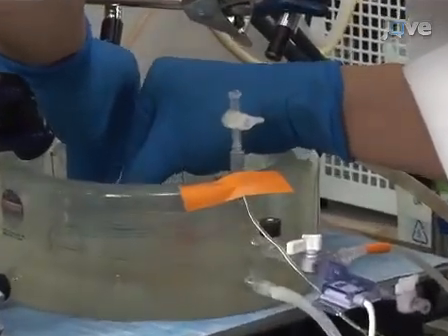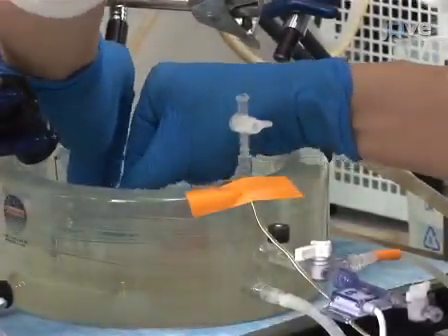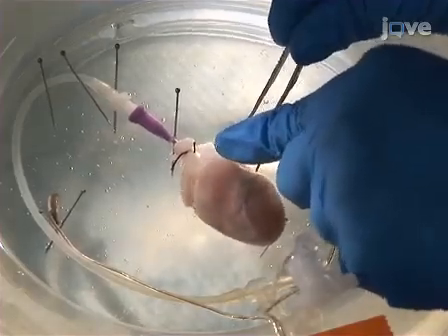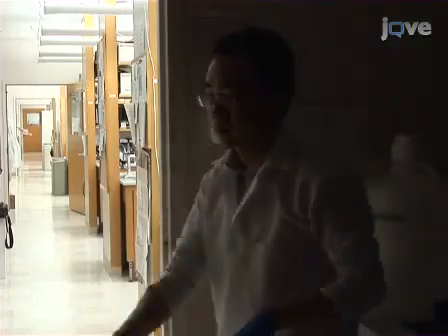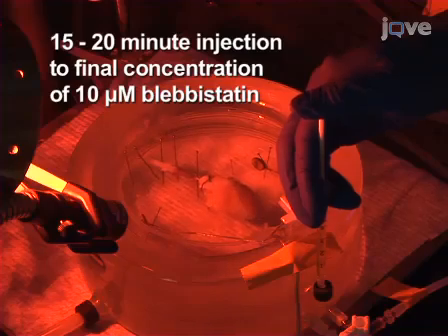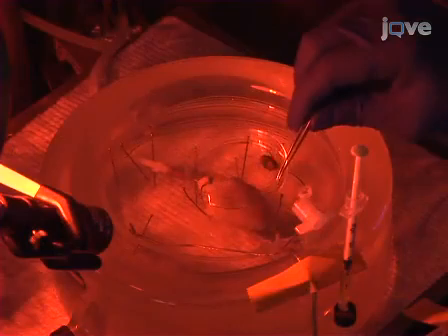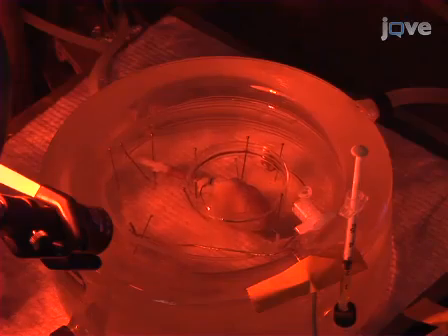Place the cannulated heart in a Radnoti glass chamber and connect the cannula to the perfusion system. Pin down the heart to the silicon bottom of the chamber at the ventricular apex and atria. To immobilize the heart, turn off the room light and slowly inject blebbistatin through the injection port. To reduce the motion of the solution surface, place a glass window cover above the epicardial surface.